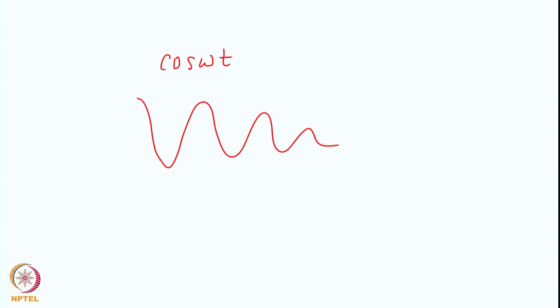Okay. Now with regard to the detection, what kind of frequencies do we get when we actually collect the data and Fourier transform? Suppose we collected the cosine component only, we call that single channel detection. So now if it is a cosine component which is getting detected, then my FID is cosine omega t, and this FID is going like this as we saw. Now when I Fourier transform this, what do I get?